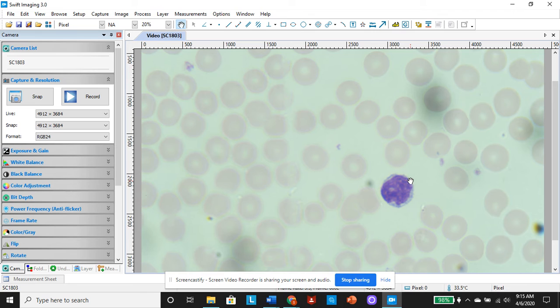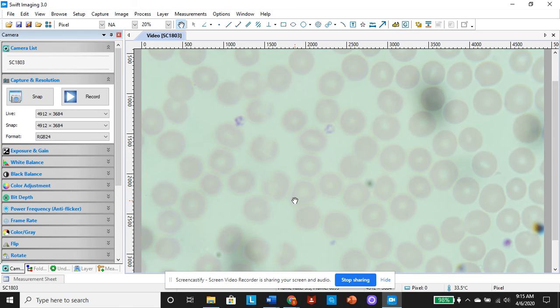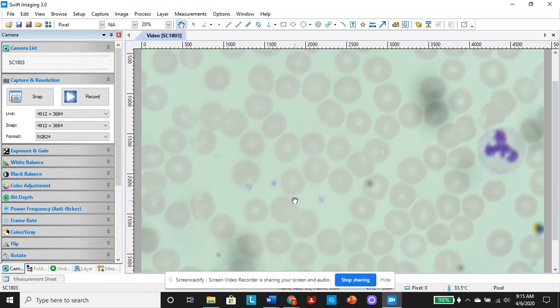And then think about a bacteria. A bacteria would fit inside this guy. So really, really tiny bacteria are. Bacteria are usually anywhere from 0.5 to, I've seen some pretty big ones at like 6 or 7 micrometers, but they're just huge.